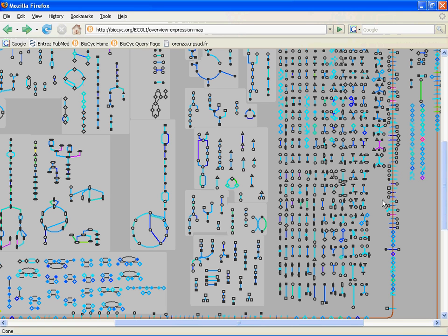If another one maxes out at a full difference of 6 log units or of 2 log units, that will also be colored red, and the color scale will be extended or compressed appropriately. And this means that you cannot, just off the top of your head, throw things at the default color scheme and compare them. But there are a couple ways we can compare them. We can set the color ranges ourselves, we can set color cutoffs, or we can do an animation. So I'm going to show you all three of those options.